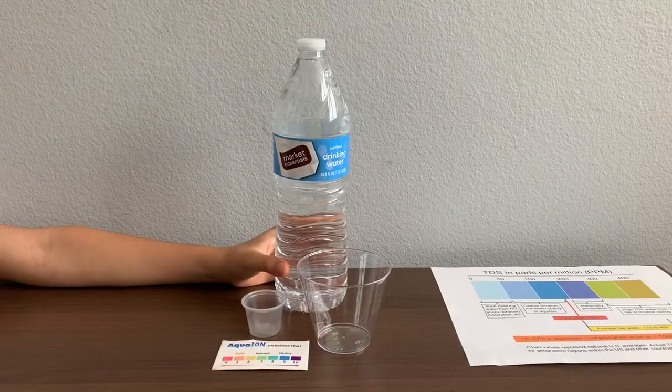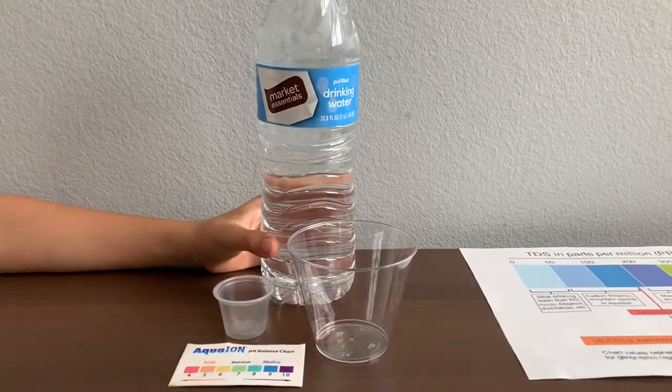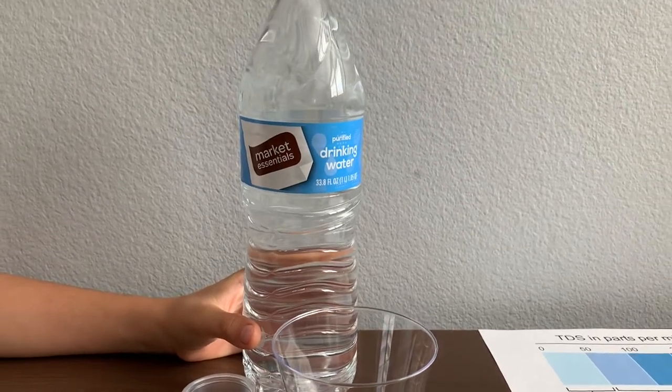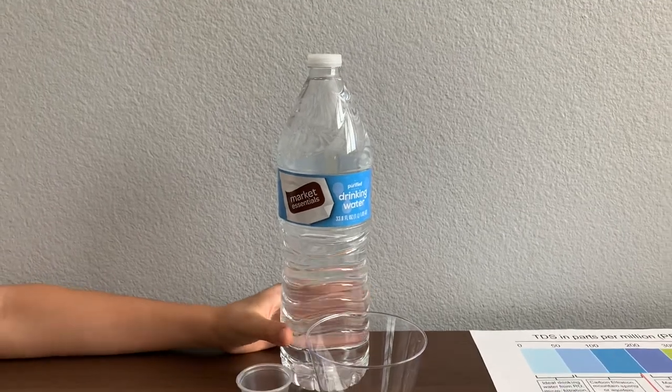This is Market Essentials purified water. It passes purification by reverse osmosis. The bottle is made out of PET plastic. It's sold at Lucky Market in San Francisco and it costs 89 cents.